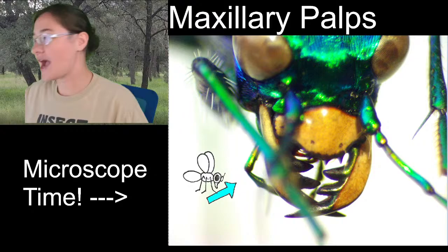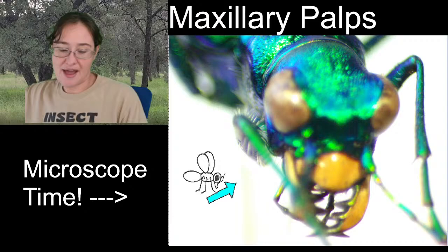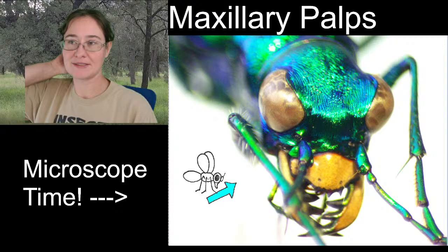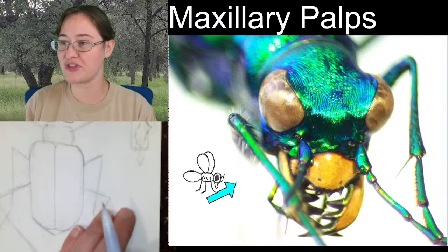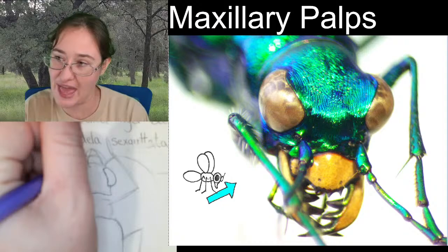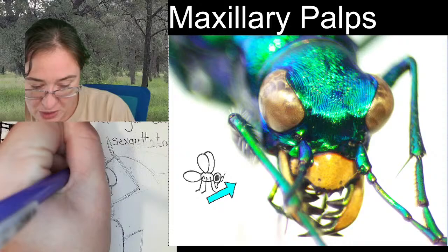All right, I do want to zoom out just a little bit so we can see the head in its entirety, because I admit I want to sketch it. I want to sketch the head on. So we'll look at it this way, and then we'll go ahead and sketch it both this way and then over here head on. When we were looking at it from the front, all we could really see in front of the eyes was a little bit of the edge of that head where it connected to the labrum. So we're going to bring it up a little bit and then give you a little bit of a wavy line, and that's the edge of our head.